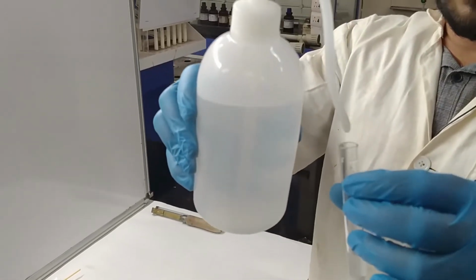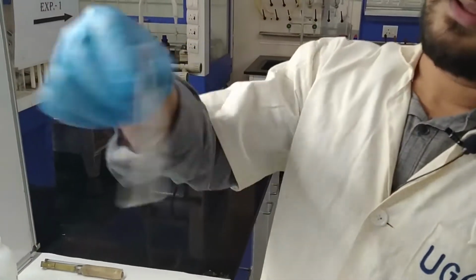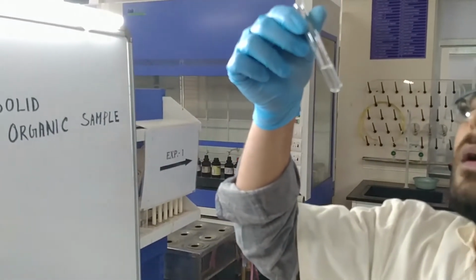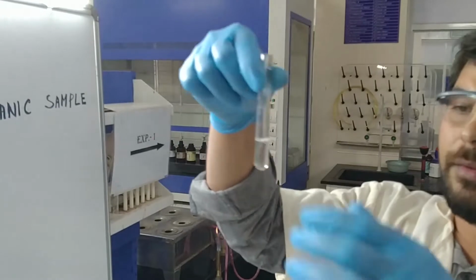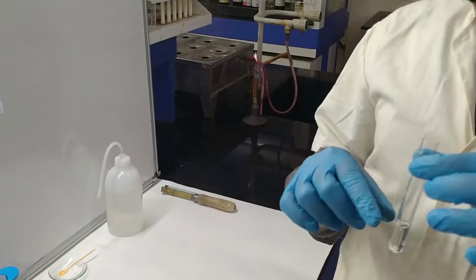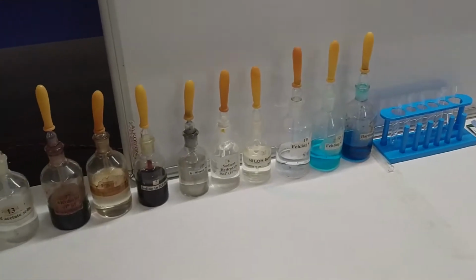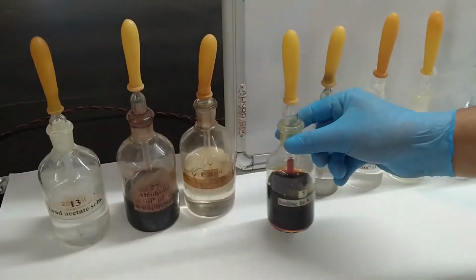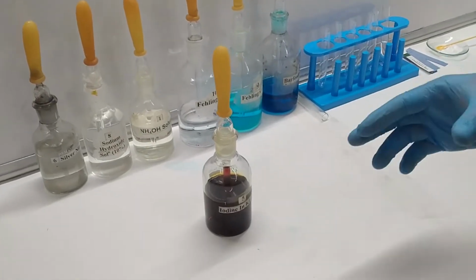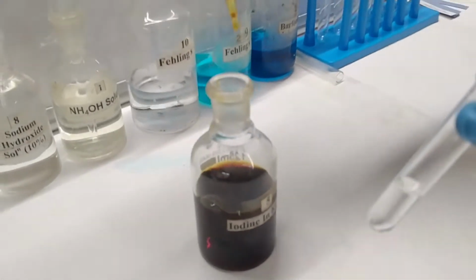Just add some distilled water inside the test tube. Let's shake this one, and this is almost soluble. Now our solution is prepared. So now we have to add over here I2 solution. That is a sample that you can find inside the lab, that is already prepared, and this one is the iodine I2 solution. So I am going to add some drops of this I2 inside the test tube. So you just see. Yeah.